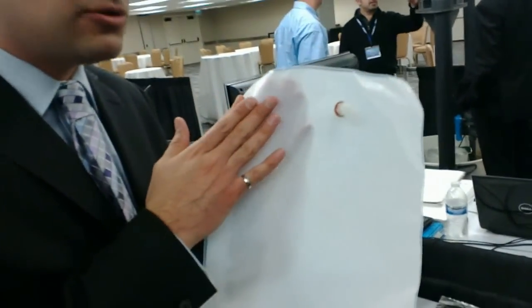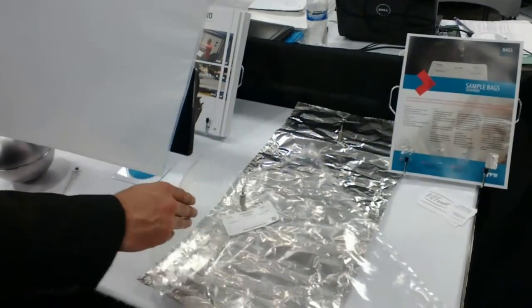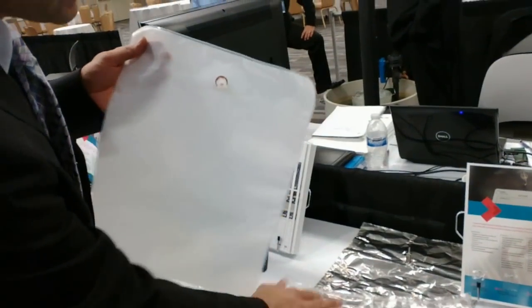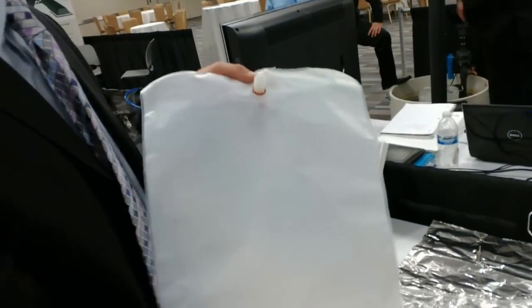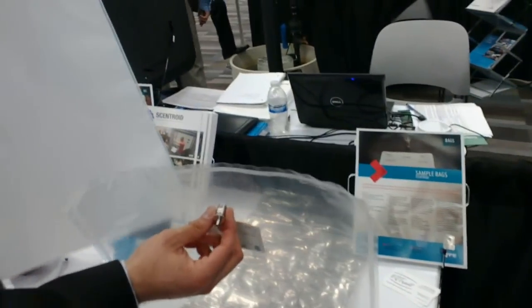If you smell it, there's no odor to Teflon when it's finished. And the price — because we can get it from a manufacturer and we buy a lot — it's the same as Tedlar. It's the same price. A bag like this, I have to check but I think this is $30. Not too bad, because the Teflon includes this expensive fitting.